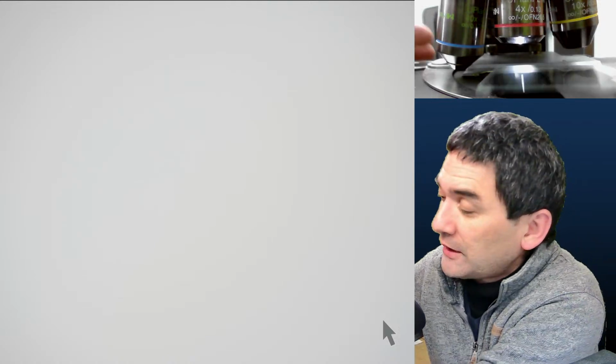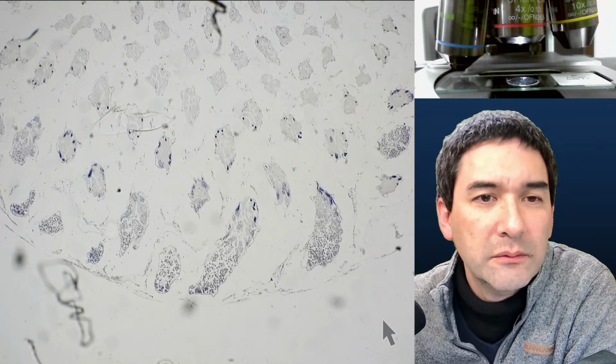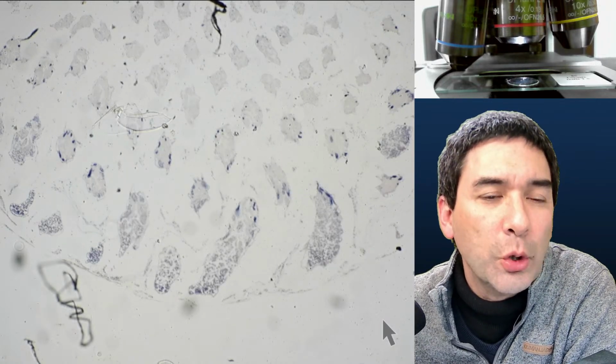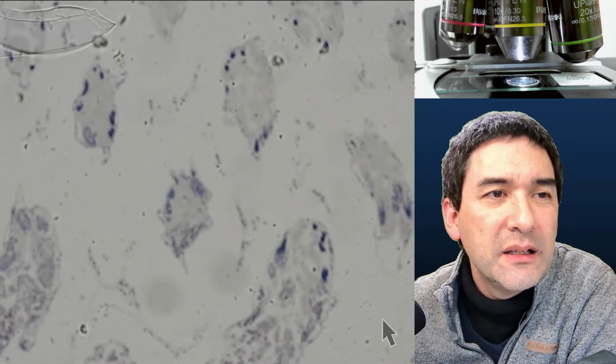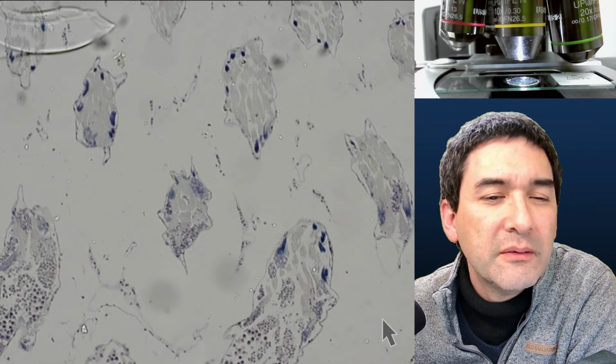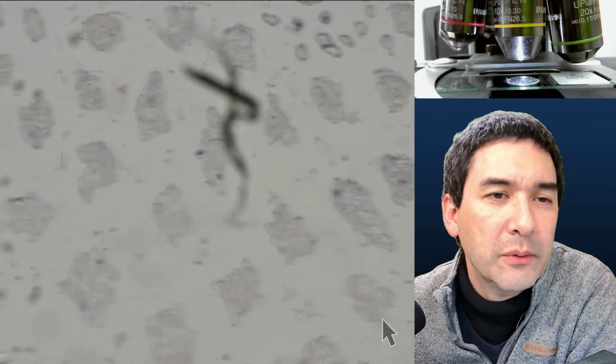So the next one is, it says here, what? Locust. Testes. Oh, okay. The testes, TS means transversal section. Never looked at this before. Okay, that's a histological specimen here. These are basically the cross section of the testicles of a locust. Okay, well now we know it.